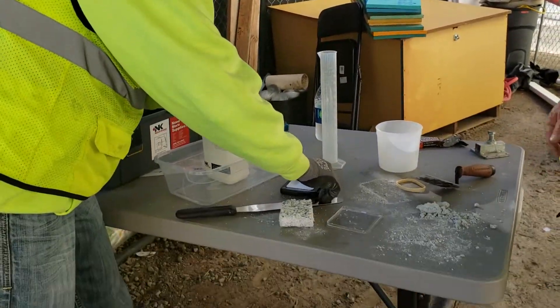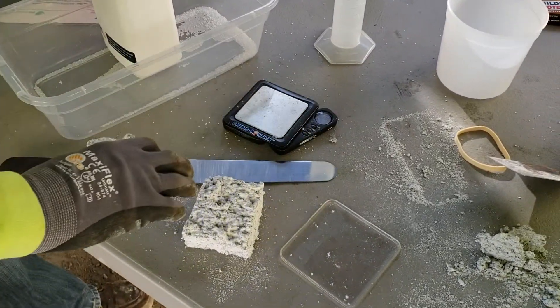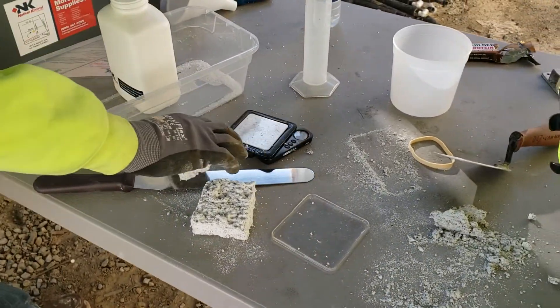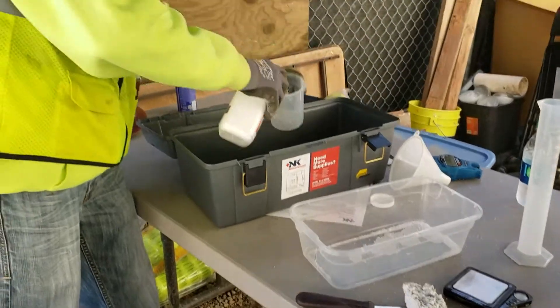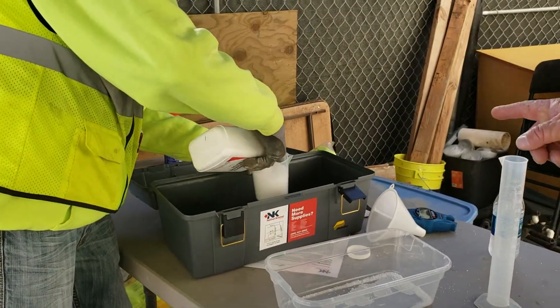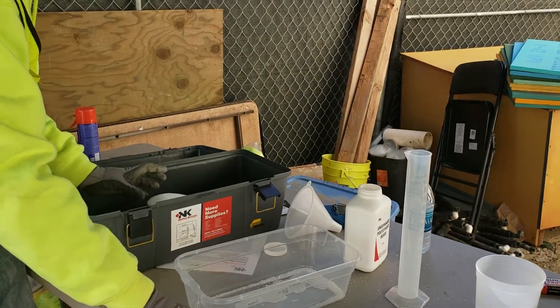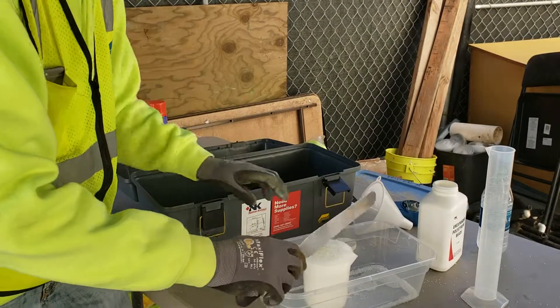You're going to weigh the sample. For the first sample, it came out at 26.2 grams. We know what it is, we wrote it down. You fill this thing up completely to the top.